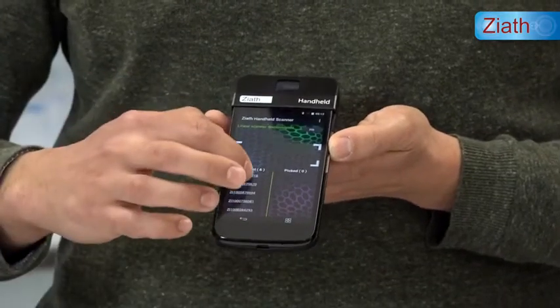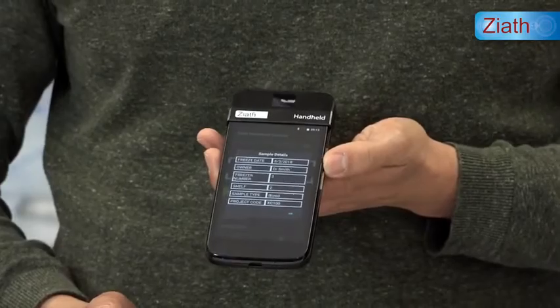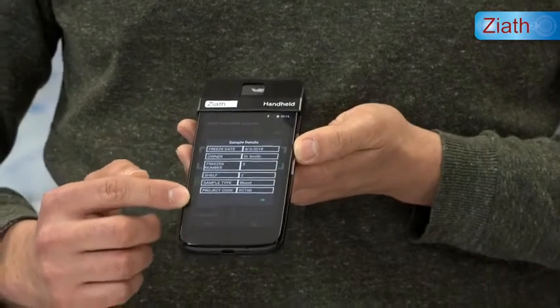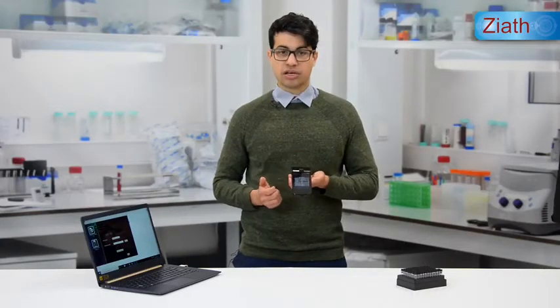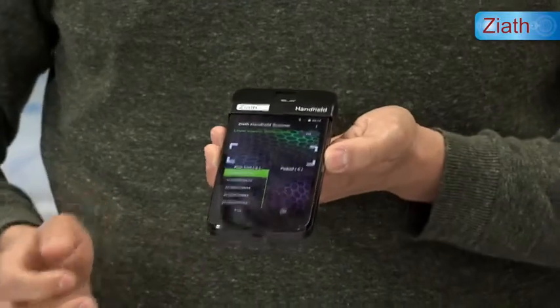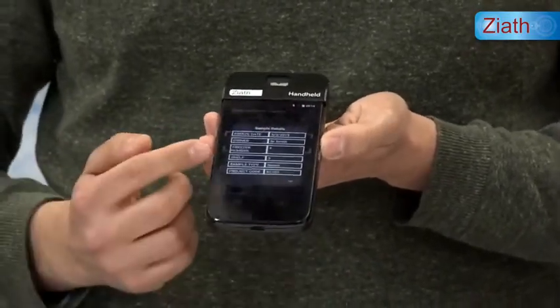We can click on individual tubes to display the sample information that was shown in the Excel file. The column headers that were in the Excel file can be seen displayed here on the left, as well as the sample information on the right. We can then go and collect the samples based on the information that is shown on screen. If I click on another tube, the sample information is also displayed on screen there.